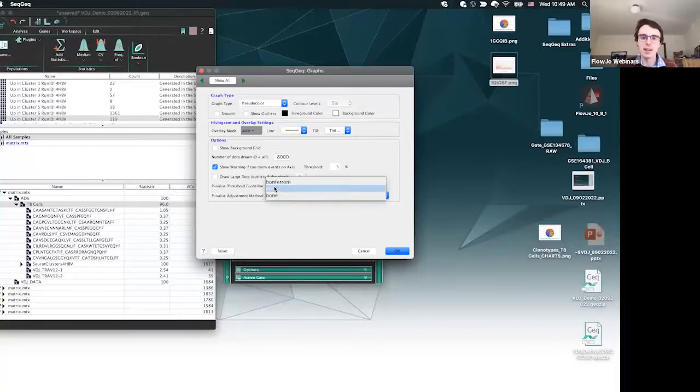And so typically, I think by default, we have either FDR or Bonferroni selected for our p-value adjustment to get that Q value. But I've turned off my p-value adjustments. That way I can look at less significant data because we have so few cells that it's just impossible to get a high significance for my up or down regulated genes.